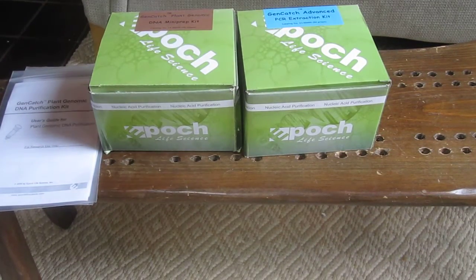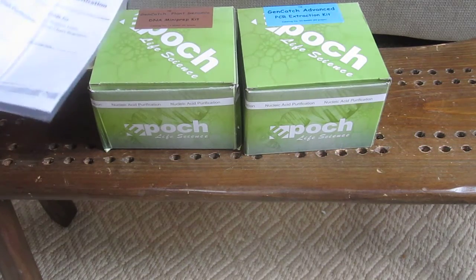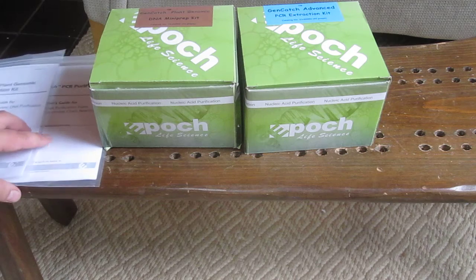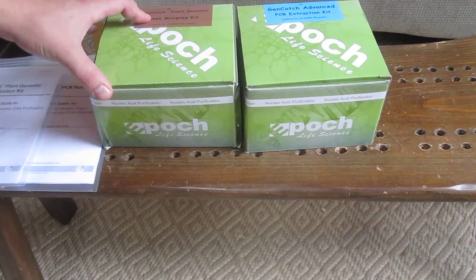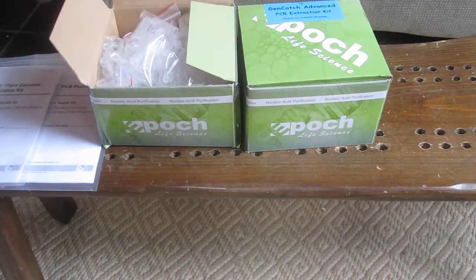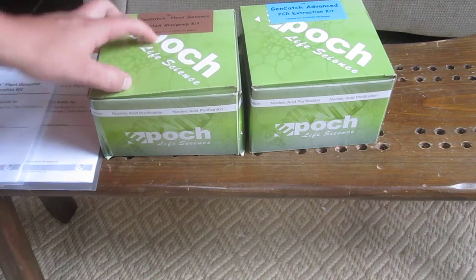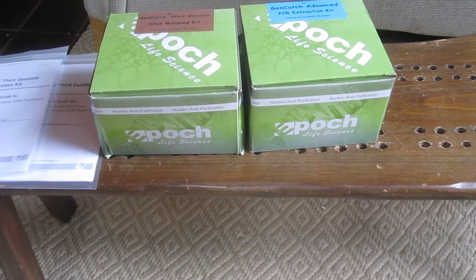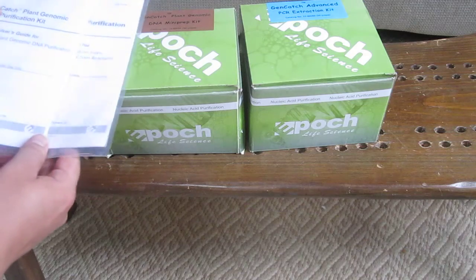Hey everyone, Dakota here from Basin Biotech. I just wanted to do a short review of two samples that we just got from Epoch Life Sciences. We asked for some samples and usually when we get samples, you might get two to five reactions as a small sample, but they actually sent us complete 50 prep, 50 reaction plant genomic DNA mini prep kits, as well as a PCR extraction kit — which is pretty cool because that's basically a whole kit that you'd normally pay for.